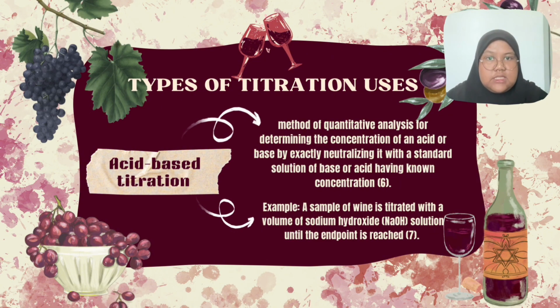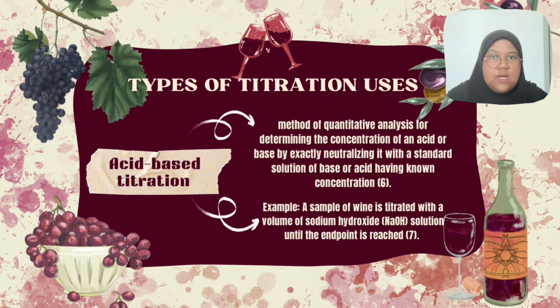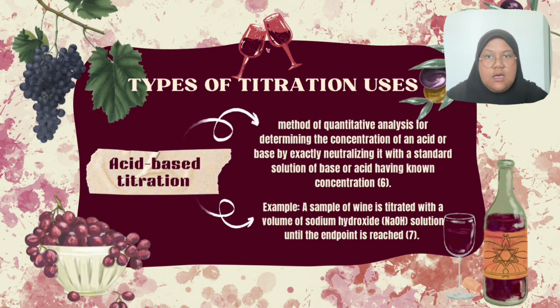This information is important because acidity affects the taste, quality, and stability of wine. A wine with the correct acidity will have a balanced flavor, resist spoilage, and maintain consistent quality between different batches. Therefore, acid-base titration is an essential tool in wine production and quality control.